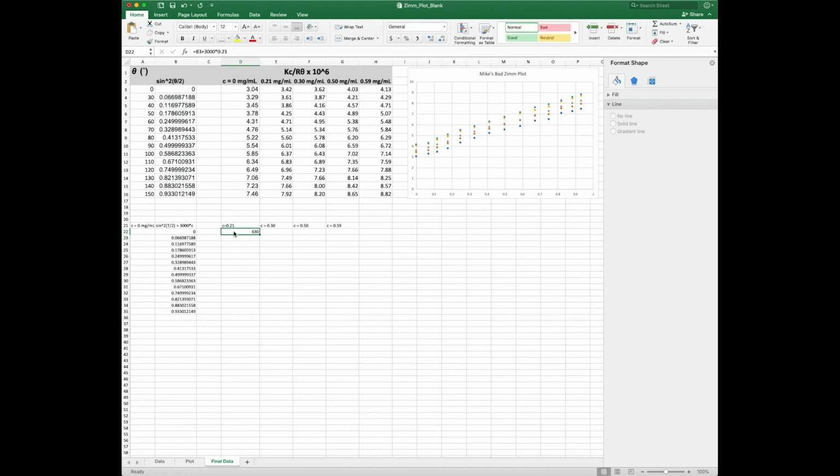That's kind of big, right? 630. It's going to really space this out. So I can either decrease the value here to something more reasonable, which I think I'm going to do. So I'm going to make it 30. And then I get 6.3. So that's kind of nice. Basically, this data here is going from 0 to 0.93. I didn't want this data here to go all the way out to 600. So I think that works nicely. We'll make that constant 30.